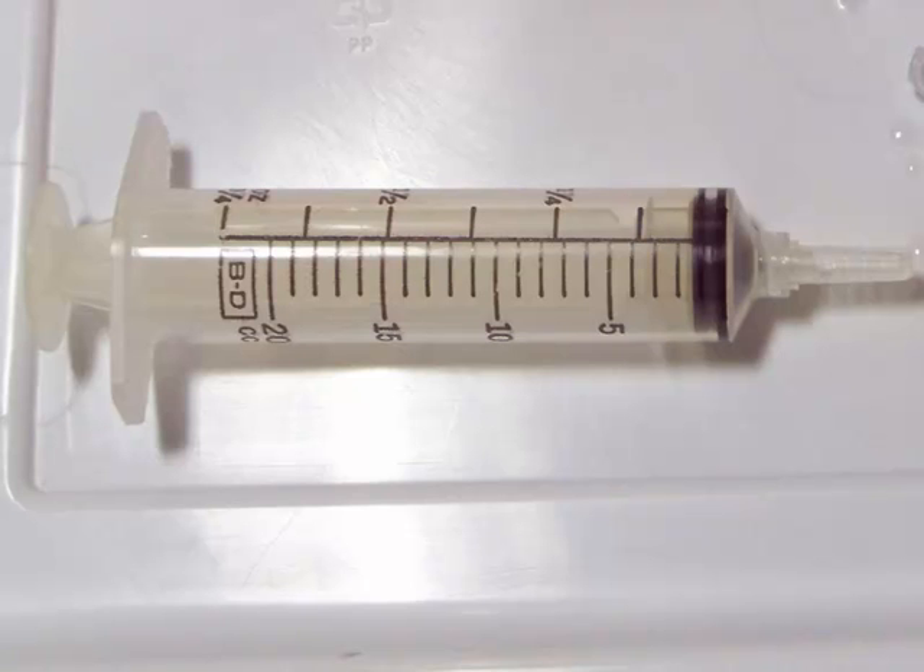Syringes — we have plenty of the 10 to 30 cc syringes here at the lab. If you would like to use these, which I think work really well, all you have to do is request them with your starter cups or cadavers.